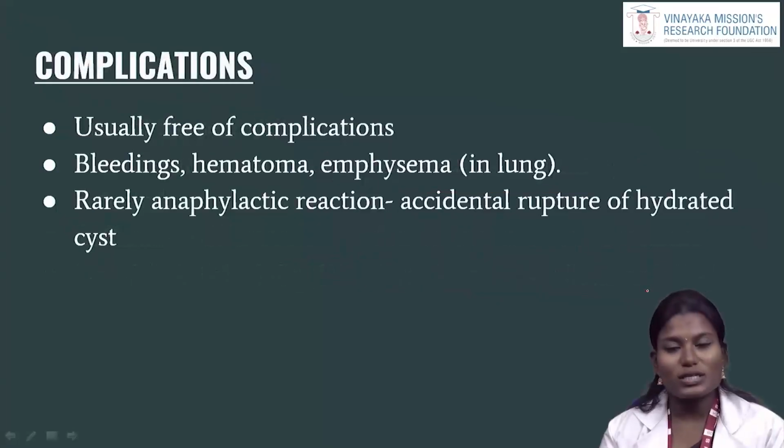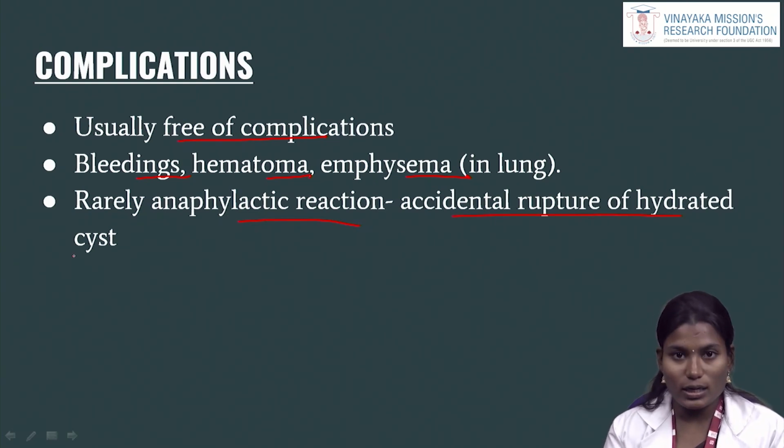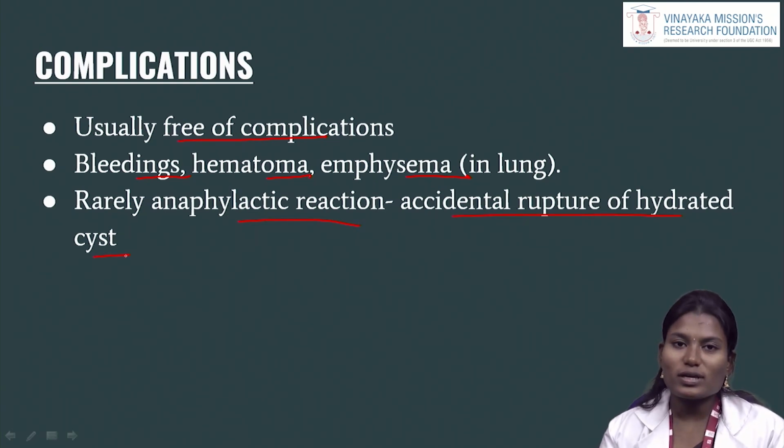Complications: what complications do we face with the FNAC technique? It is usually free of complications. These include bleeding, hematoma, and emphysema in the lung areas. Rarely, anaphylactic reactions and accidental rupture of a hydatid cyst. Students, we see the FNAC technique in three methods: with aspiration, without aspiration and ultrasound-guided aspiration.